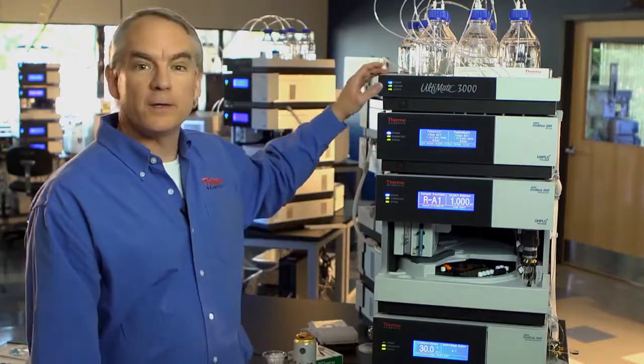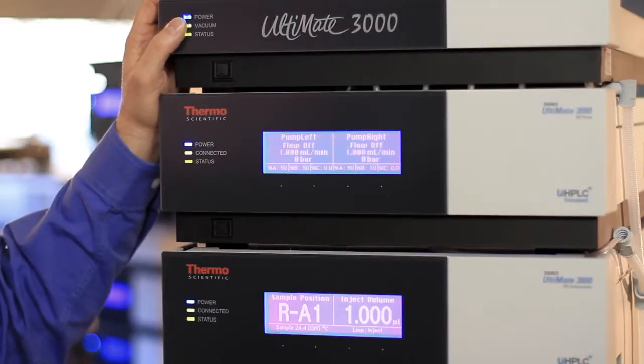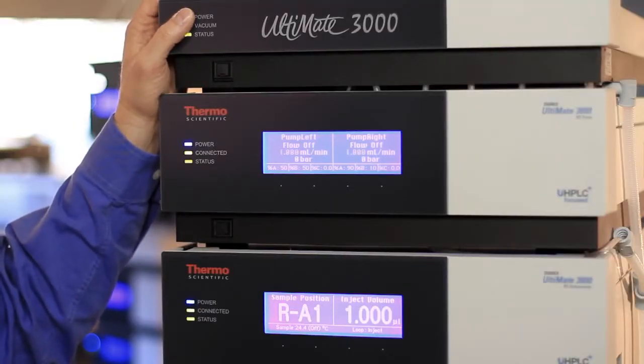The technique that they're using is called online solid phase extraction, and that's basically a technique implemented on a liquid chromatograph that unifies one of the basic parts of the workflow, that is sample preparation, and integrates it with the separation and detection steps. The platform that they're using for that is the Thermo Scientific Ultimate 3000 UHPLC Plus System.